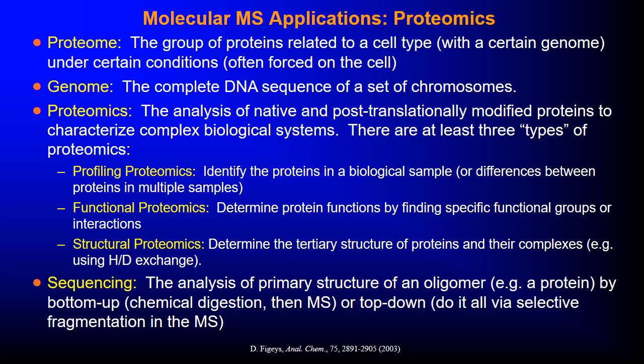Proteomics is the analysis of native and post-translationally modified proteins to characterize complex biological systems. There are at least three types of proteomics. Very hard to pronounce that word.